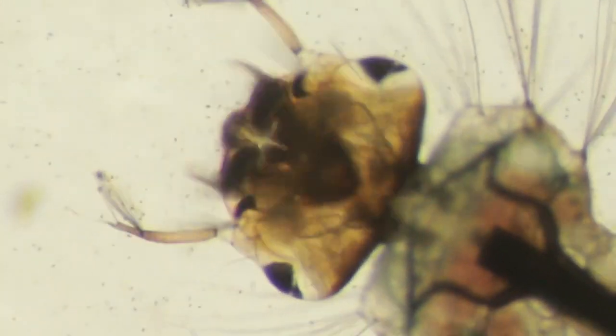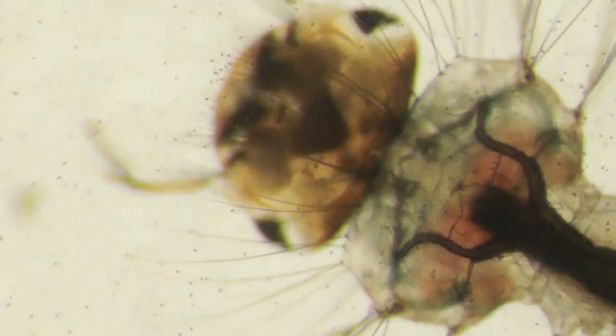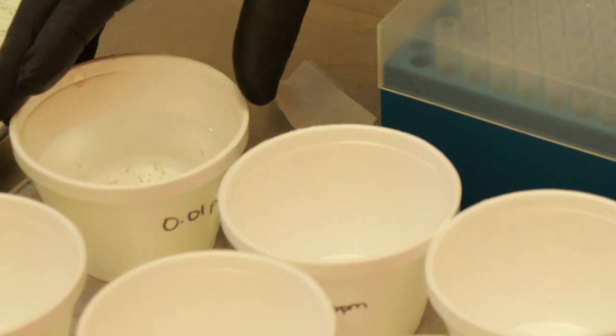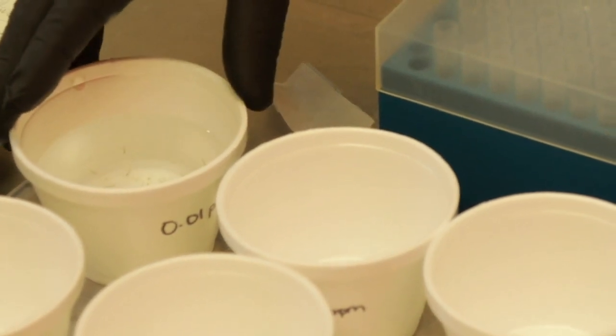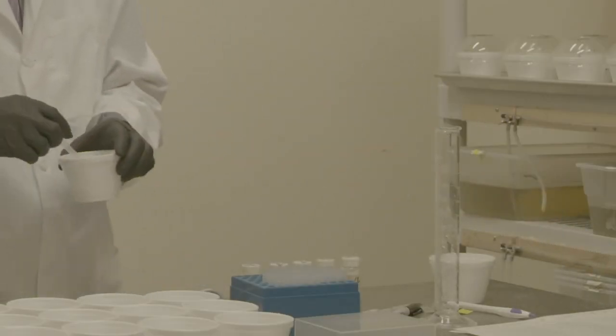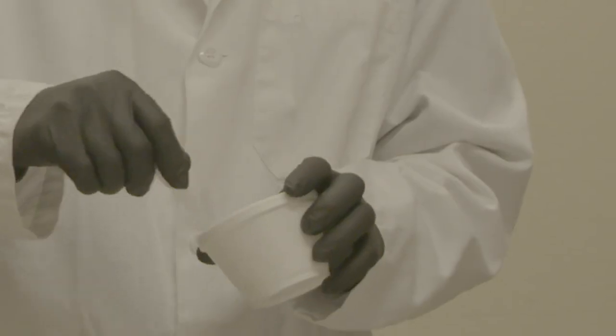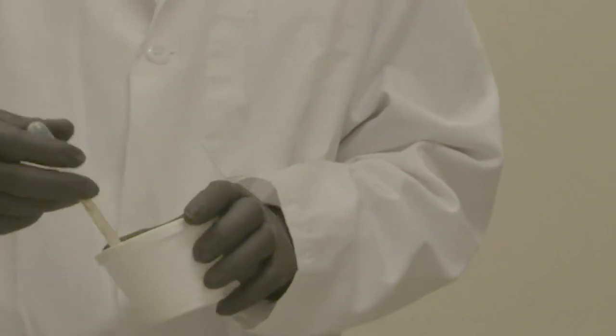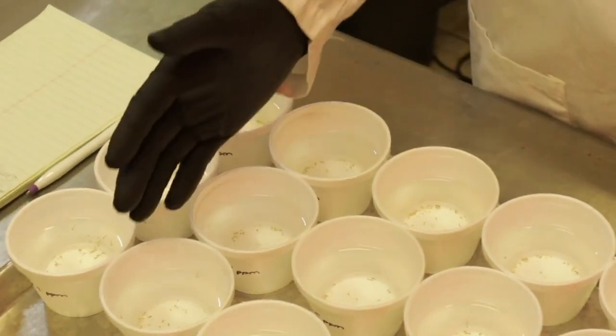Whether or not you provide food for the larvae, you want the food supply to be consistent across replicates in each bioassay and among bioassays, especially if you are interested in long-term trends of resistance in your mosquito populations. Food level and type need to be consistent and should be quantified.